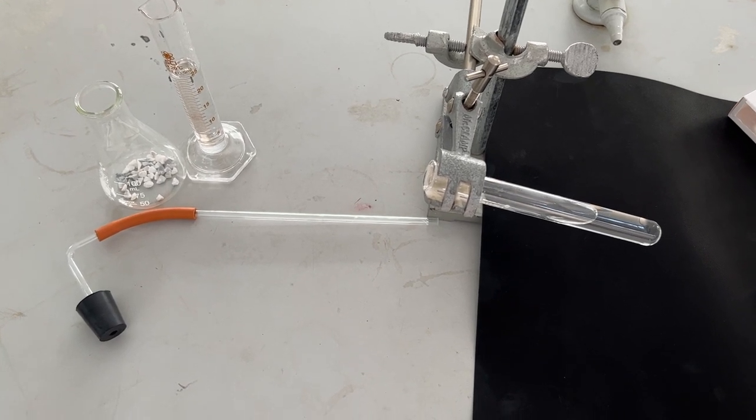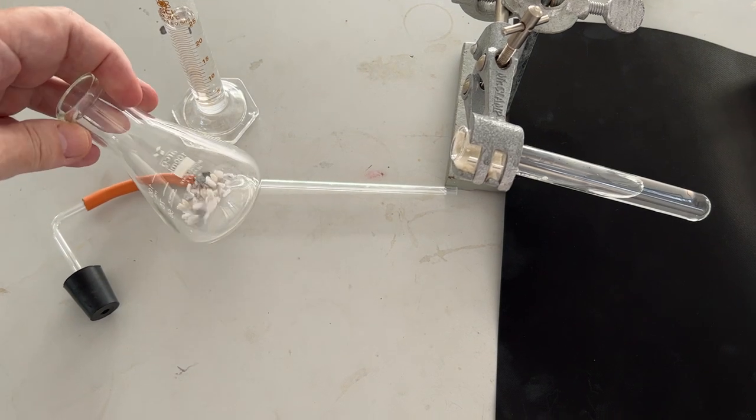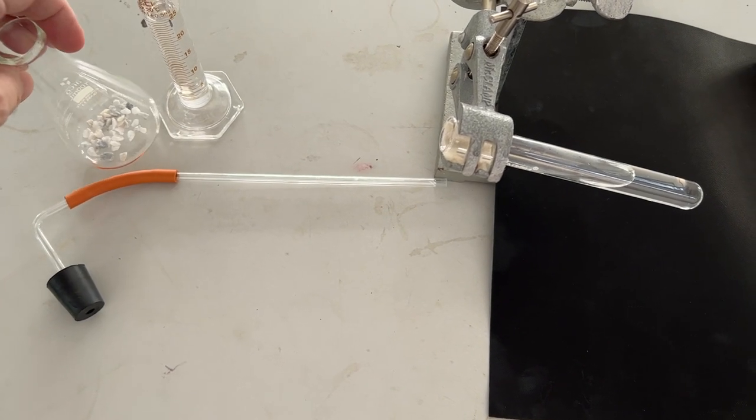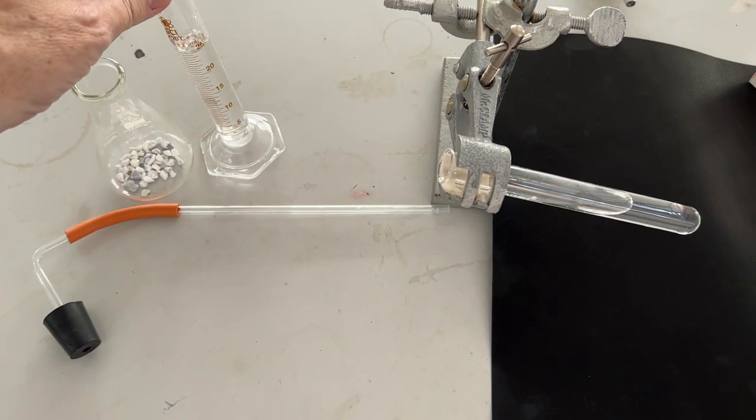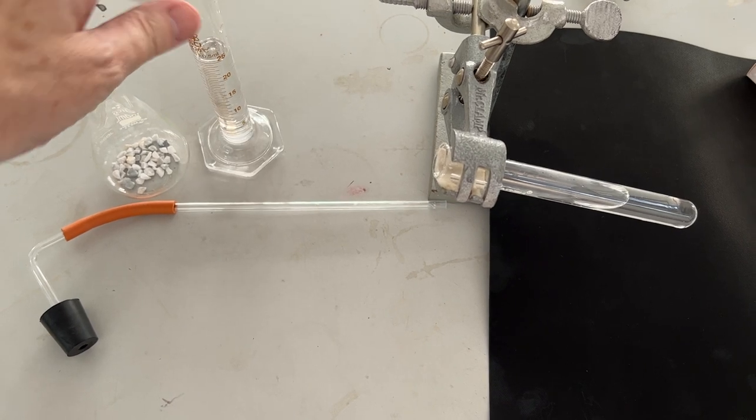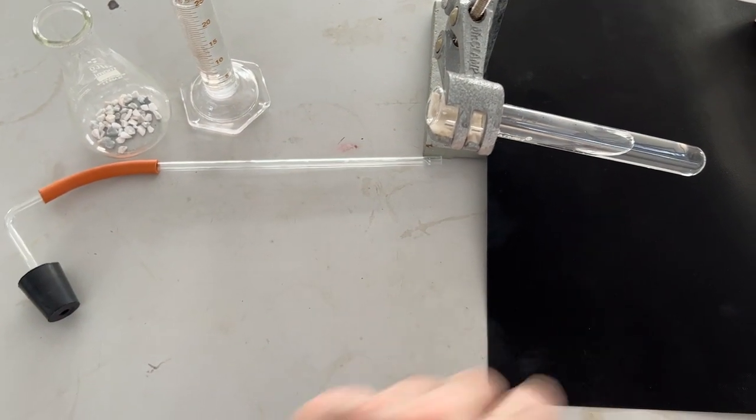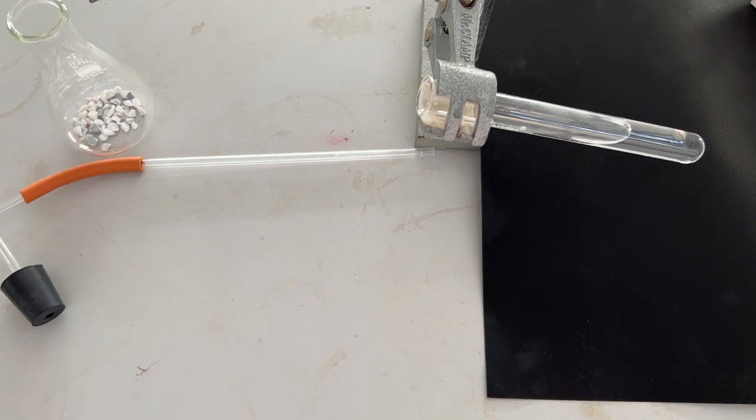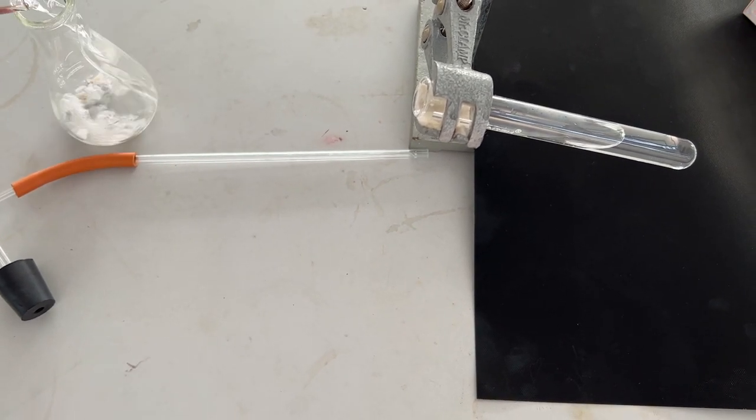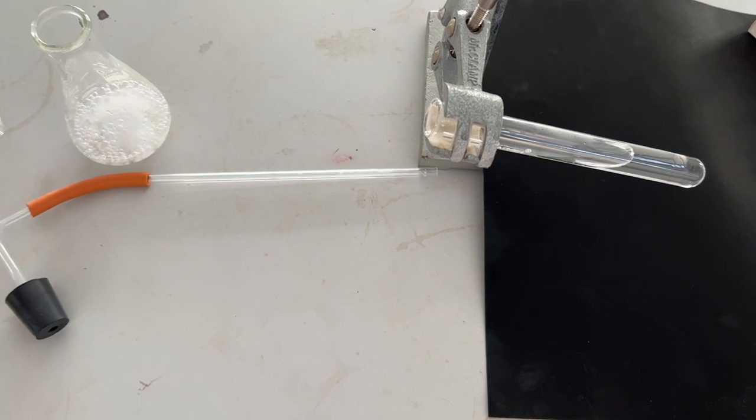Testing for carbon dioxide. Here we've got in the conical flask some calcium carbonate chips, two molar hydrochloric acid, and in the tube here some lime water. If we add the acid to the chips, we get the characteristic reaction of an acid with a carbonate.